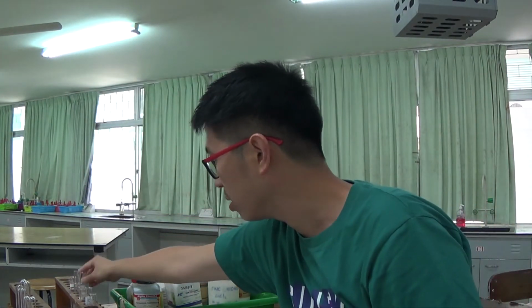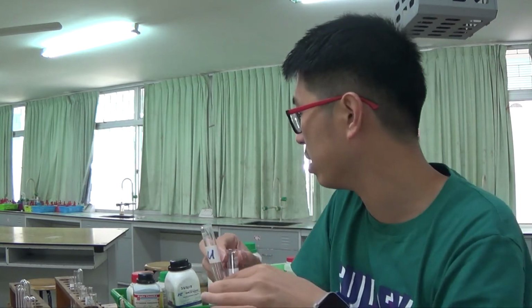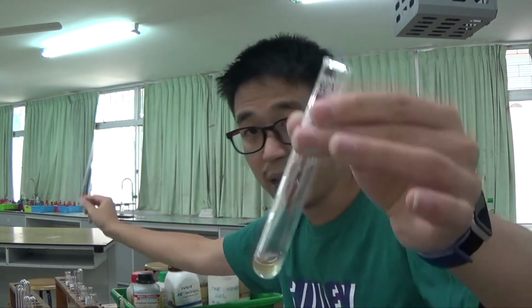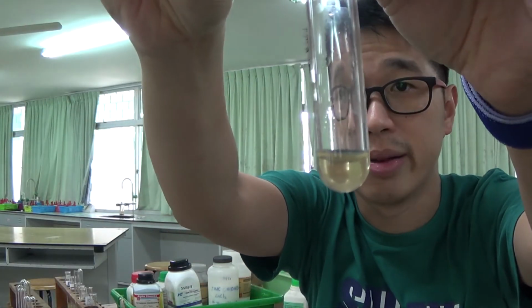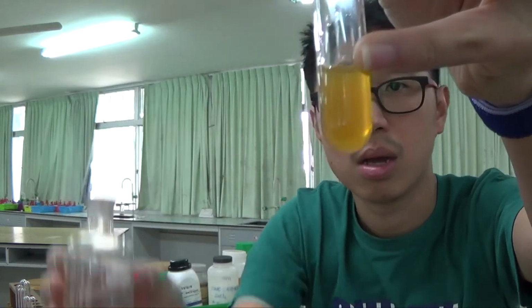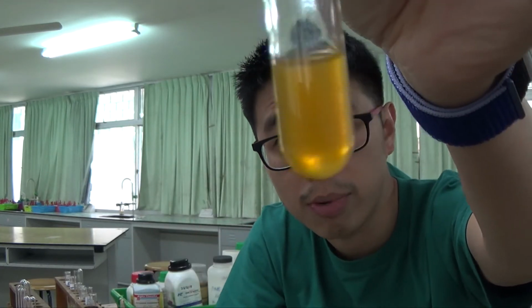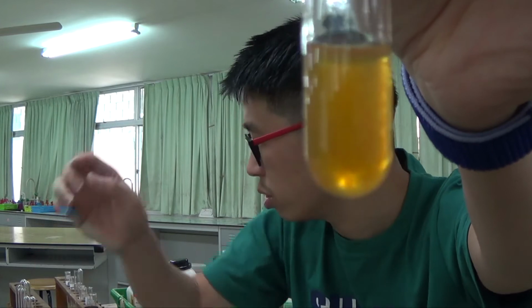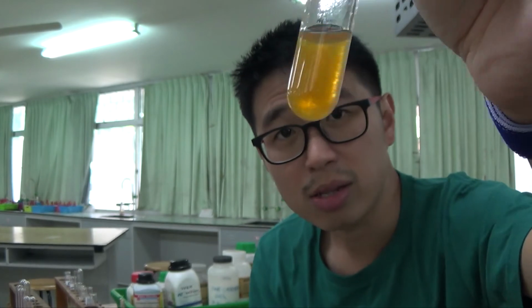So there's ammonium iron 3 sulfate, does not matter. It has iron 3, it's a solution. I'm going to add ammonia. I add ammonia a little bit, so around this level. It's not a see-through solution, okay? You see, it's kind of cloudy, it's kind of blurry because it is a precipitate. It looks like it's not very concentrated because I've used a mixture, a double salt, right?